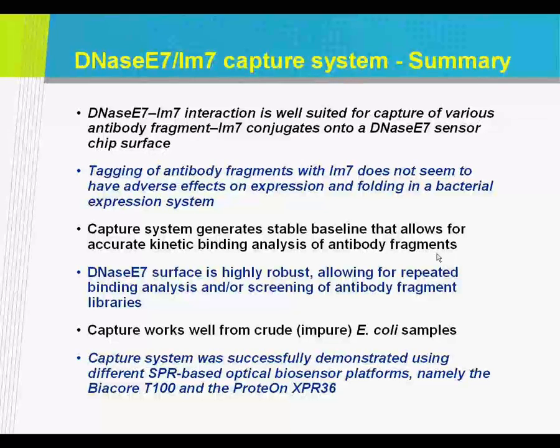For whatever reason, sometimes through either my fault or operator's fault, or sometimes the way you're setting up your immobilization, you can end up with an inconsistent immobilization, or a gradient immobilization, across your ligand channel.